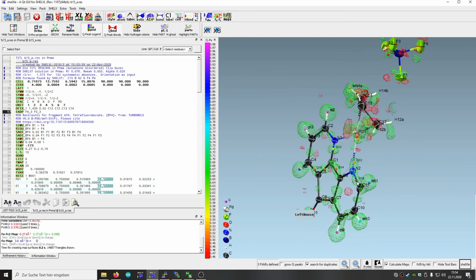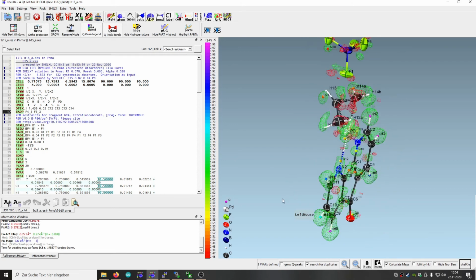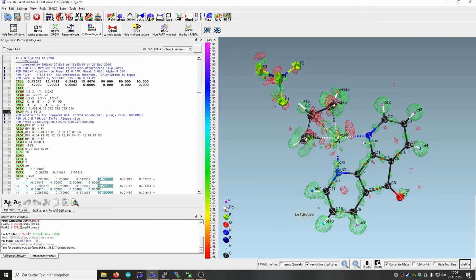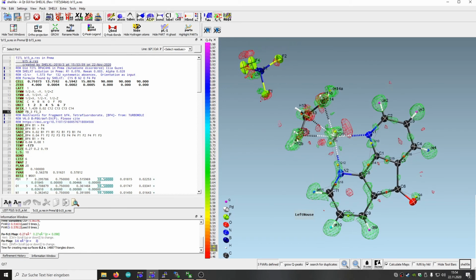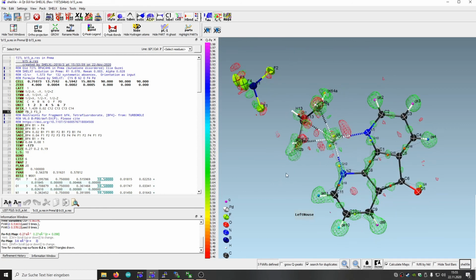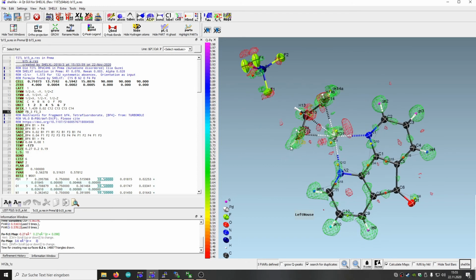And as you can see, they look a bit strange for a molecule with double bonds, but there is also this palladium atom which is bonded to them, so this is considered then not really a CH2 ending of a double bonded species, but we have here another extra bond, so it will have a different AFIX.